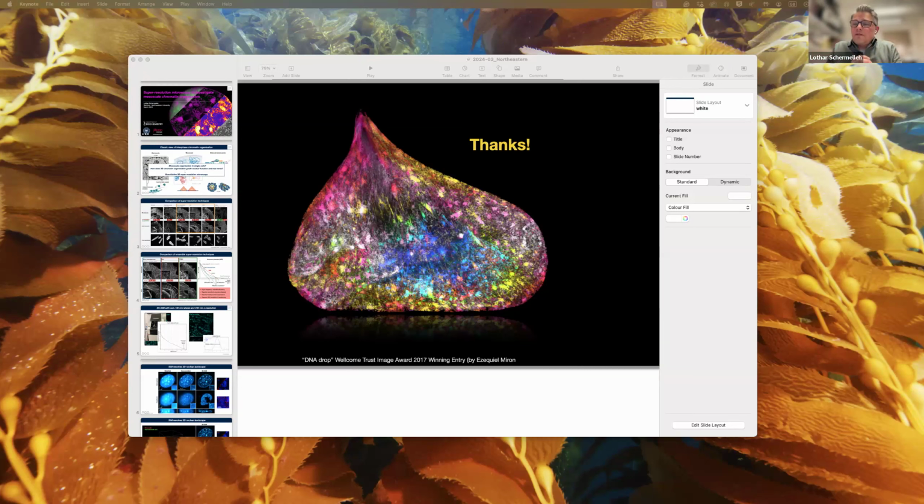Okay, very interesting. Thank you. I was a little confused about the volume assigned to an SMC dimer. If I'm not mistaken, it is on the order of 1 times 10 to the 7 cubic nanometers, which would correspond to a cube with a linear size of about 200 nanometers. Oh, yes. Yes, so basically, of course, our resolution is not isotropic.